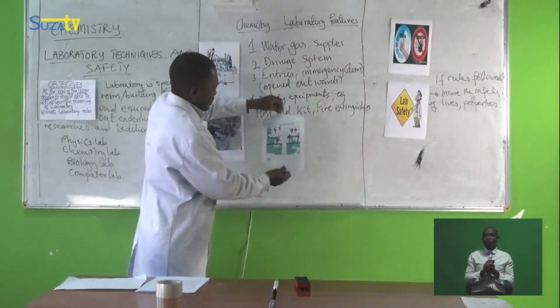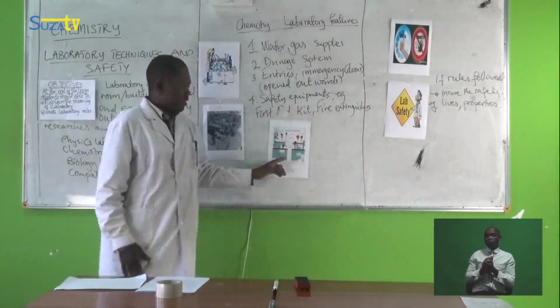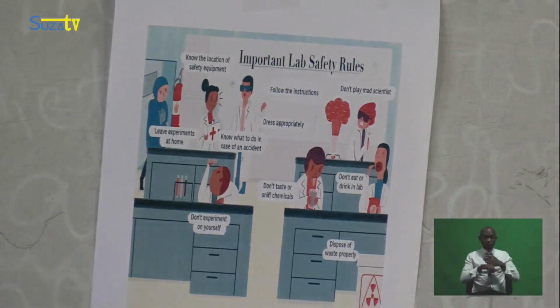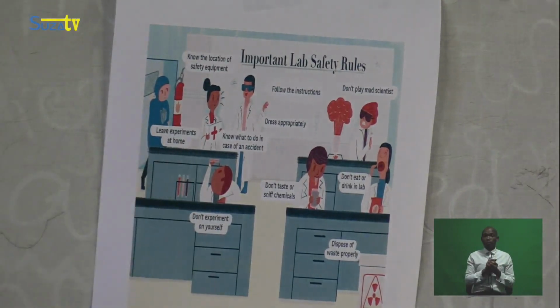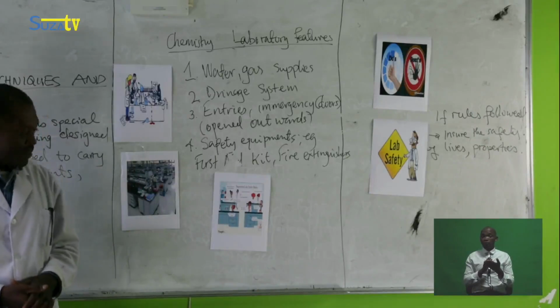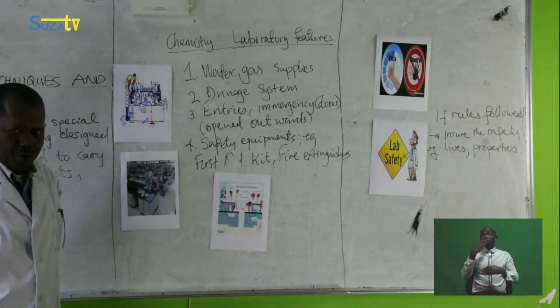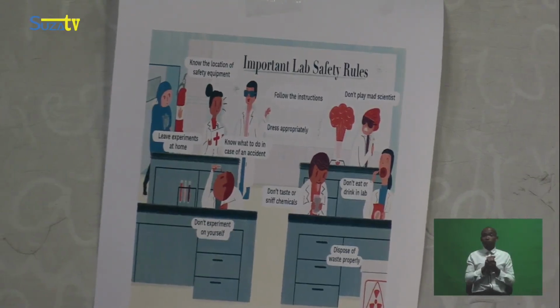We have got this picture. This picture shows students which are in laboratory. And there are some of the statements that we can call rules. If you look at them well, important lab safety rules.